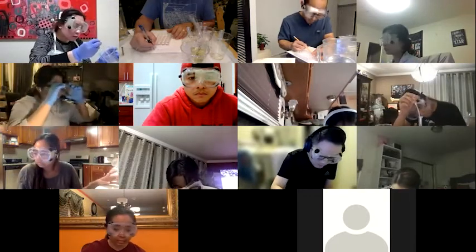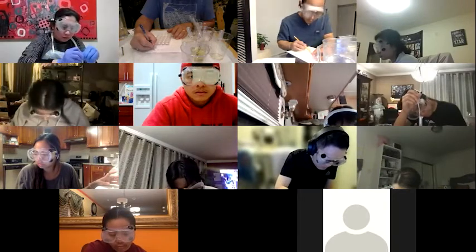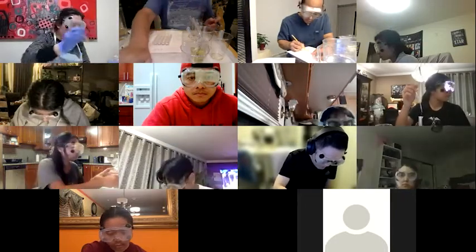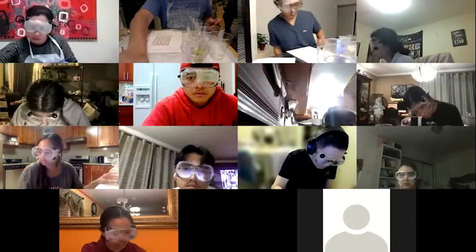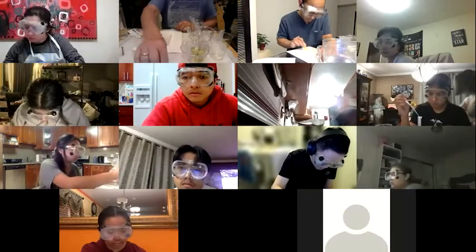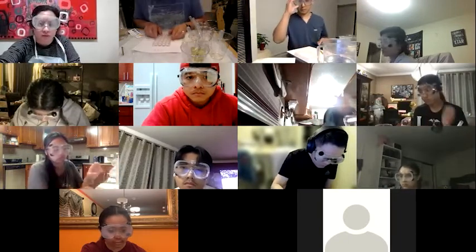Fourth column, 10 drops NaOH. Yeah, so I would just recommend writing that right on the paper, right above the column that you're going to be putting it in.